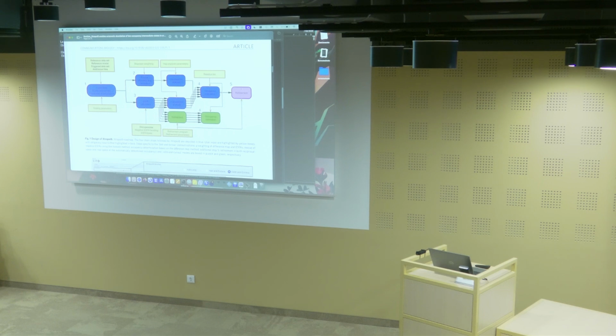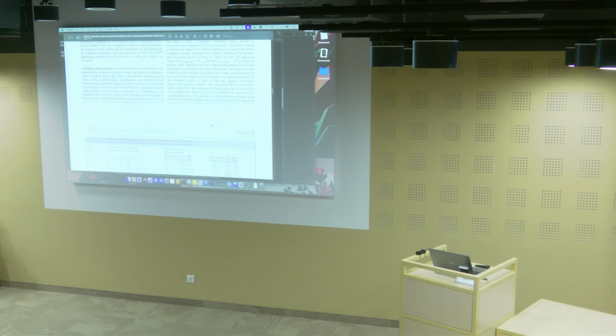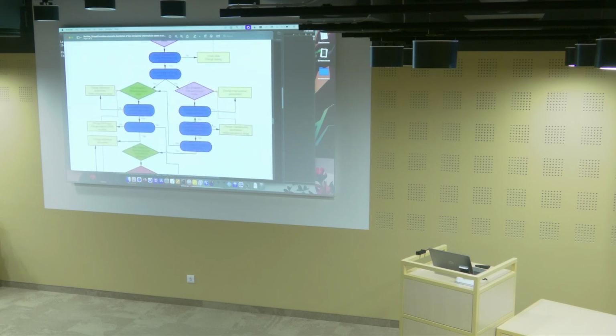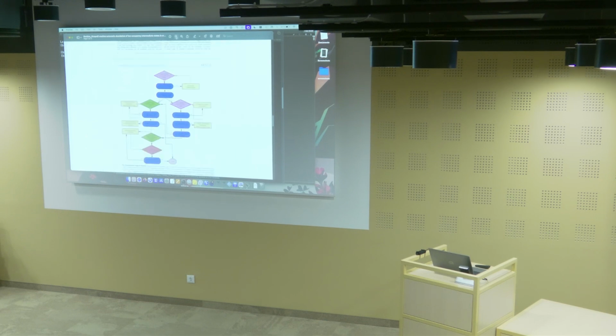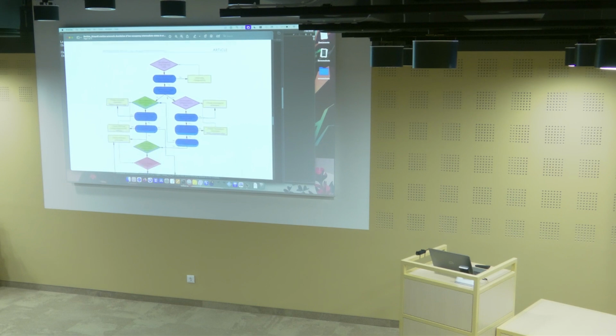do some automatic refinement. In the calm and curious mode, we actually do refinement with all the different extrapolated structure factor amplitudes that were calculated with these different alpha values, from which we can then also have another method to estimate the occupancy. A bit lower in the publication, you can find some kind of flowchart that we suggest to use.